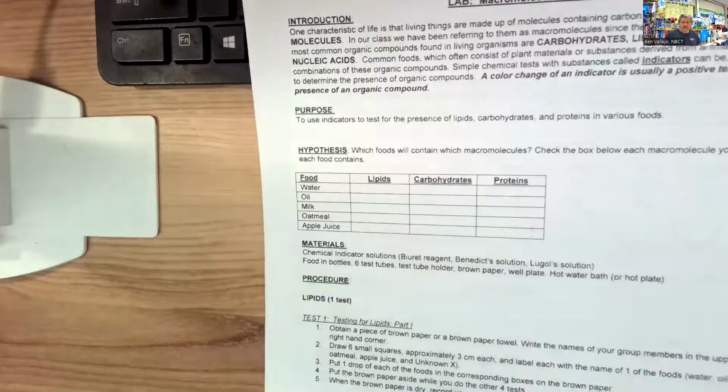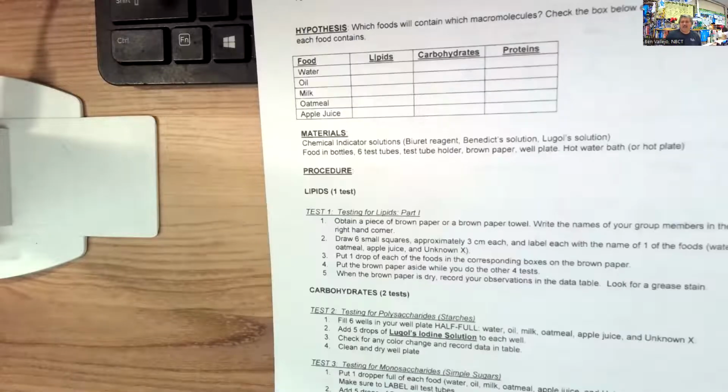So why don't we pause for a second and go ahead and put a check mark here if you think that water contains lipids, carbohydrates, or proteins, and do that for the other 4 solutions as well. So I'm going to pause here and then we will come back after you have made your hypothesis.